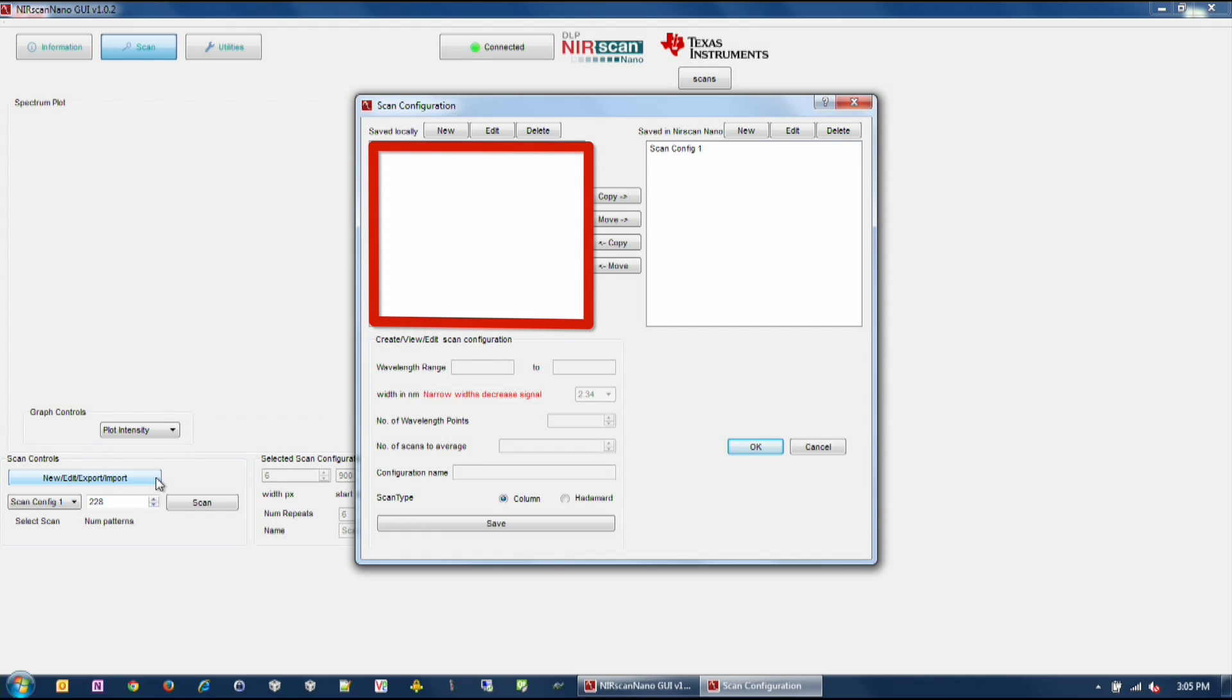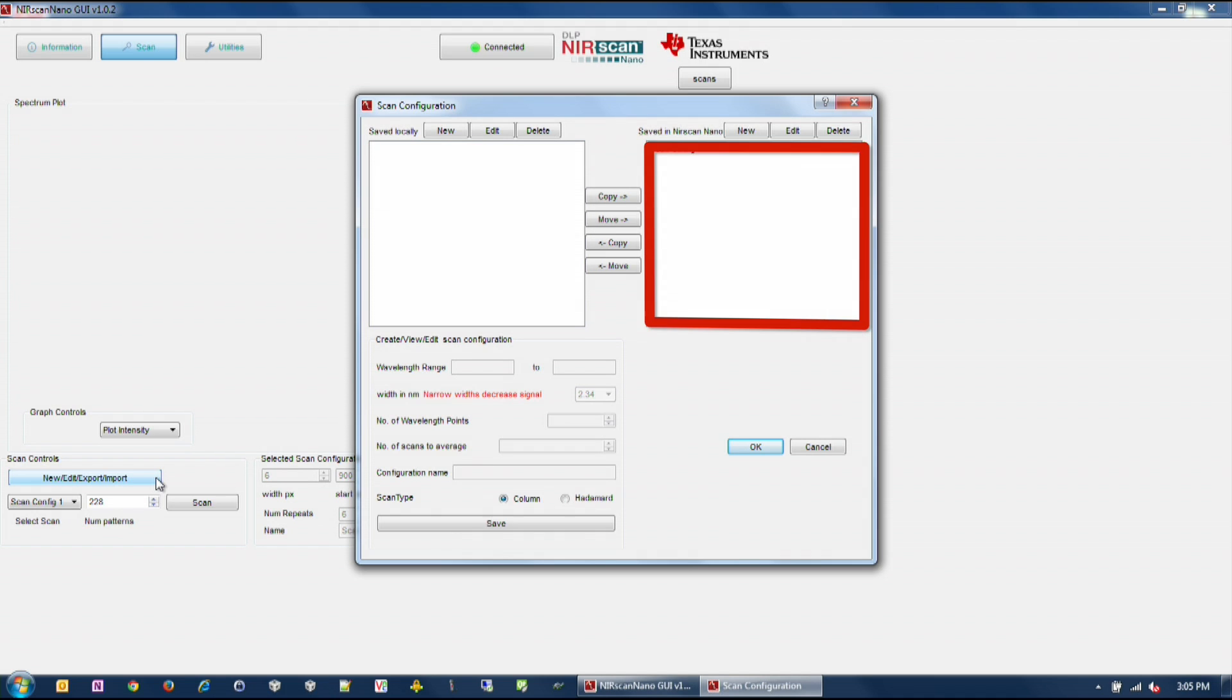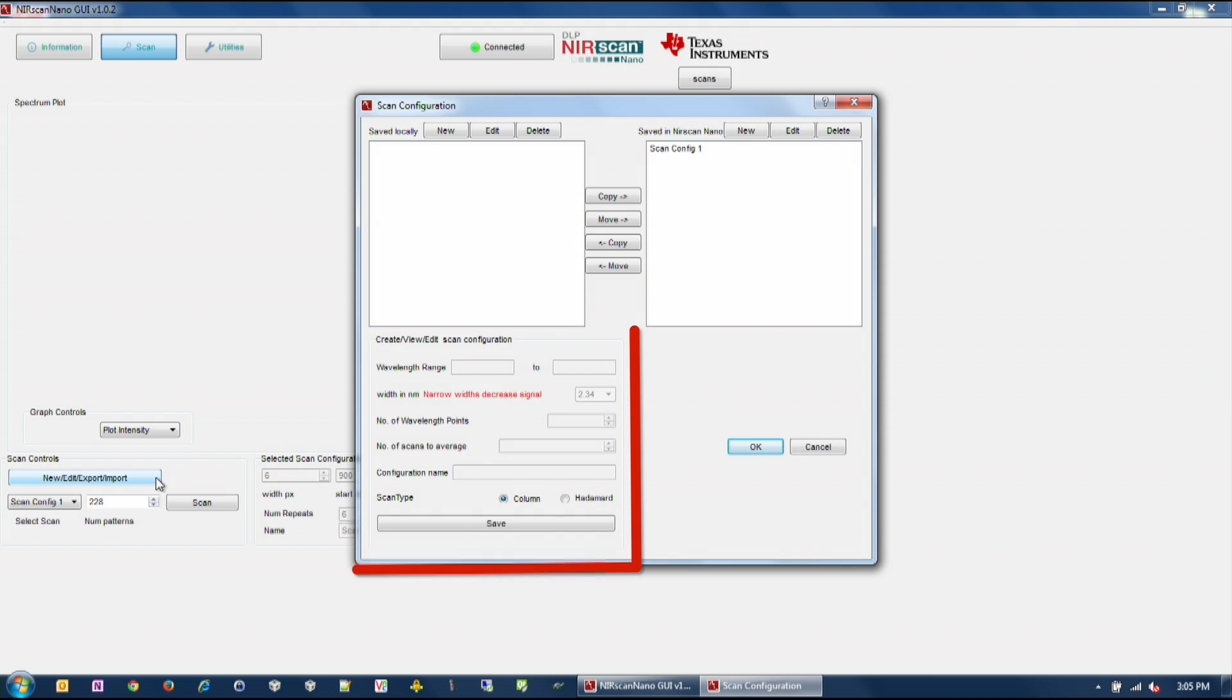The top left section displays previous scan configurations saved to the PC. The top right section displays the scan configuration saved on the DLP Nearscan Nano EVM. The bottom section displays the scan configuration parameters of the selected PC or DLP Nearscan Nano EVM stored scan configuration.